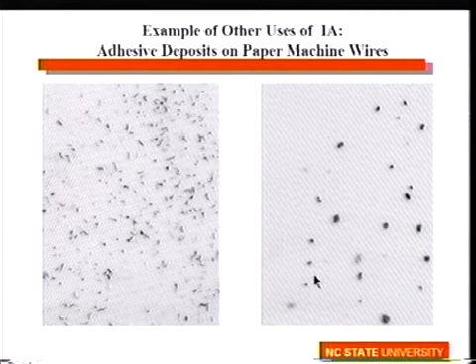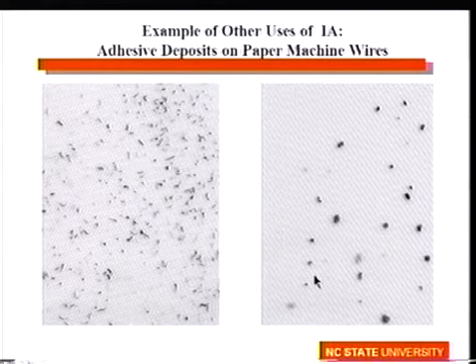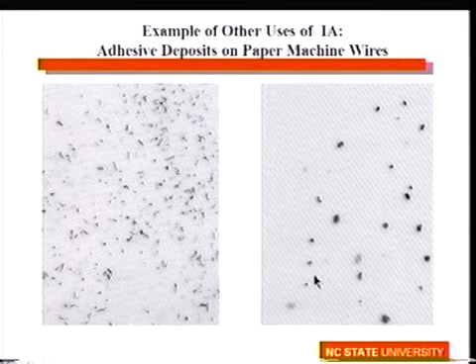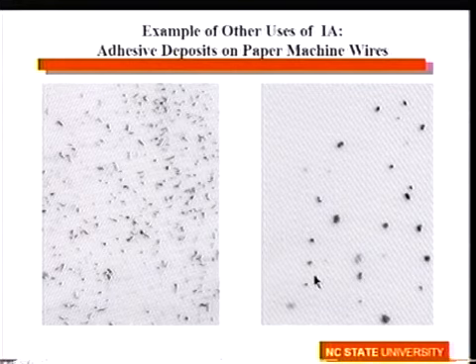Or the other thing we can do is image analysis before and after dyeing. Before dyeing, and the assumption here is that the stickies are white and the inks are dark, we're just measuring the image analysis of just the dark ink. And then after dyeing, where the stickies have become dark because they picked up some specific dye, then we're measuring ink and stickies, and the subtraction of the two might give us a measure of the stickies concentration.